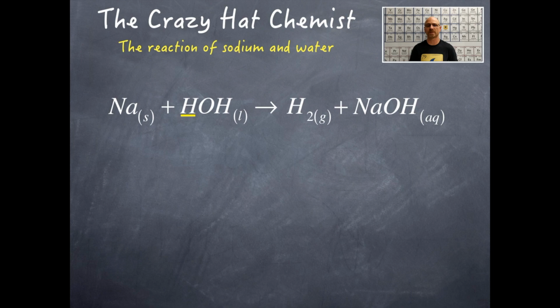That's why the AQ here. So that's a sodium ion and a hydroxide ion. Now, in the second demonstration, there was something added to the water, and I didn't denote that initially, but the thing that I added to the water was a chemical compound called phenolphthalein. And phenolphthalein is an acid-base indicator. Okay? It is colorless in an acid solution, and it is a pinkish color in a basic solution. That sodium hydroxide produces hydroxide ions, which is, of course, a base. That's why in the graduated cylinder, it became pink in the water portion of it.